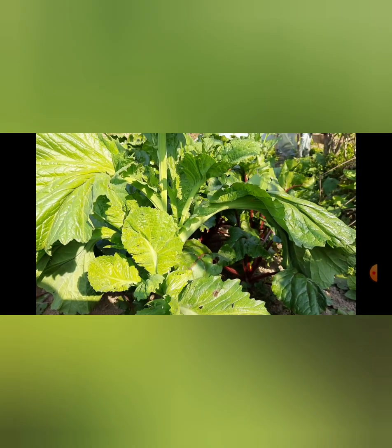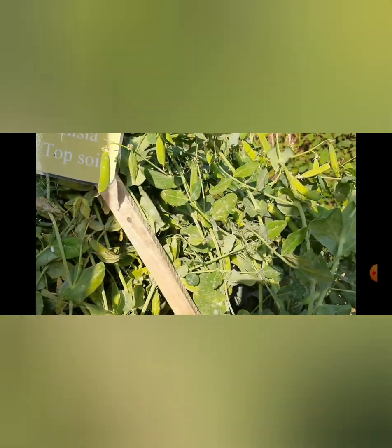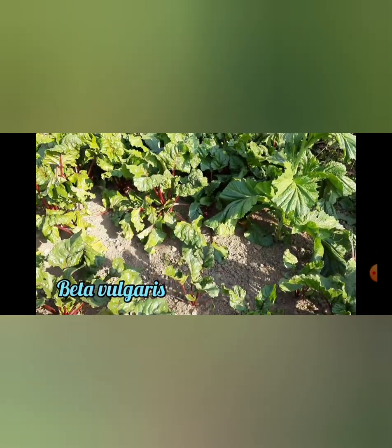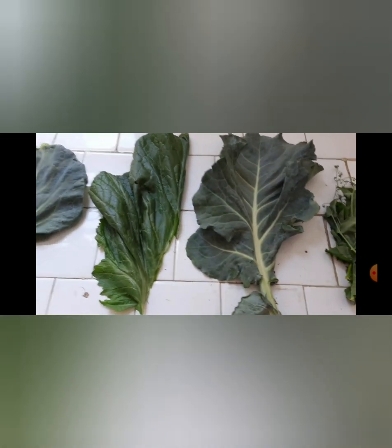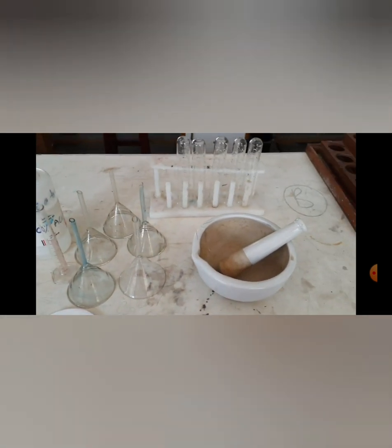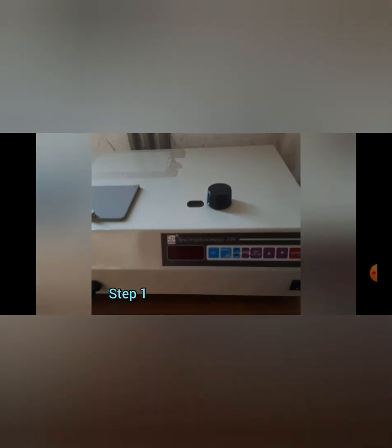Now to go with the procedures. Firstly, we collected these specimens — these are the specimens we have taken to check the chlorophyll content. These specimens were taken in the lab. These are the materials we have used: we have used the mortar and pestle, test tubes, funnel, filter paper, and 80% acetone is required.